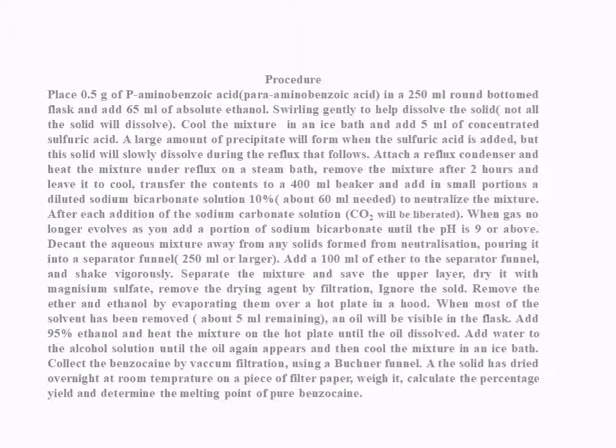Dry it with anhydrous magnesium sulfate. Remove the drying agent by filtration. Discard the solid.